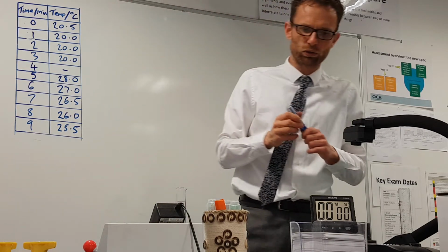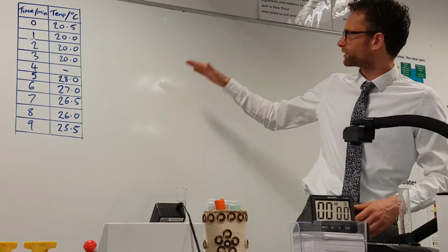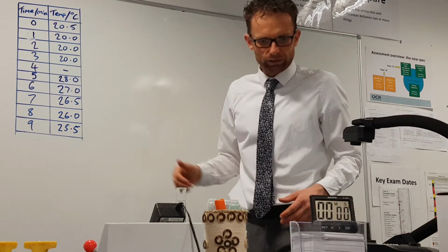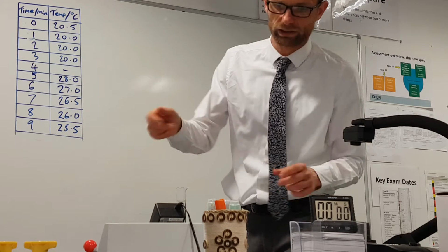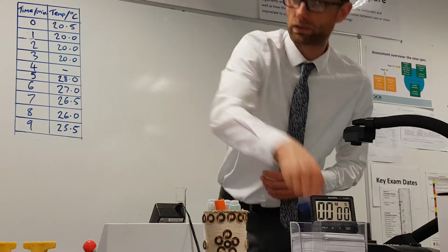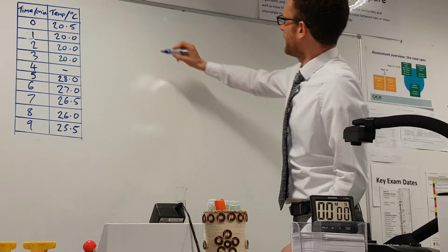Etc. And you will keep recording some data until we've got sufficient. Now, what you do then is plot what's called a cooling curve, and I'll do that quickly so you can see what we're going to do.